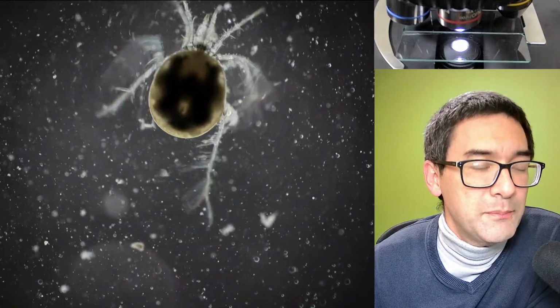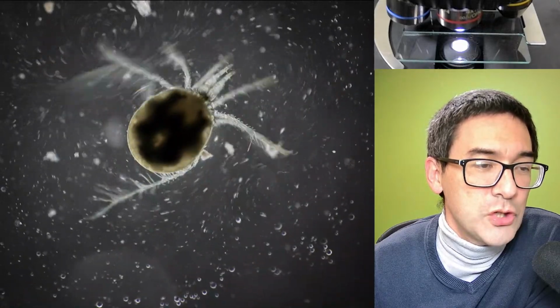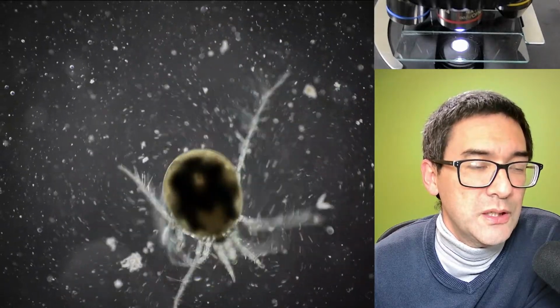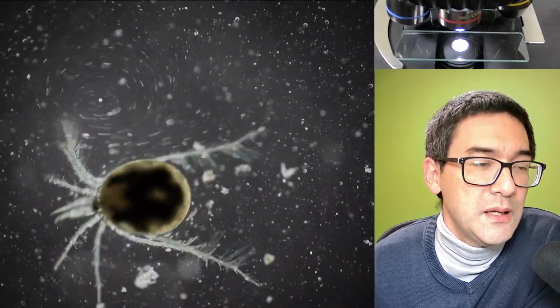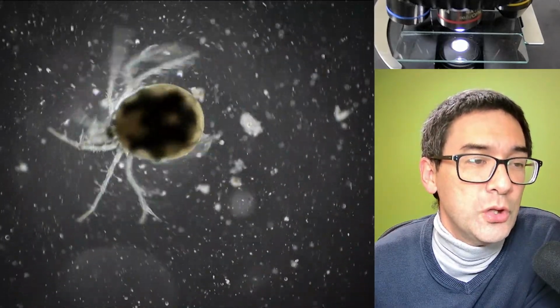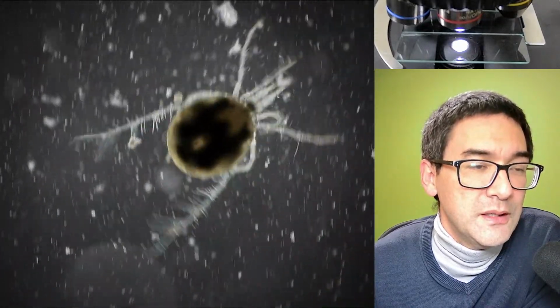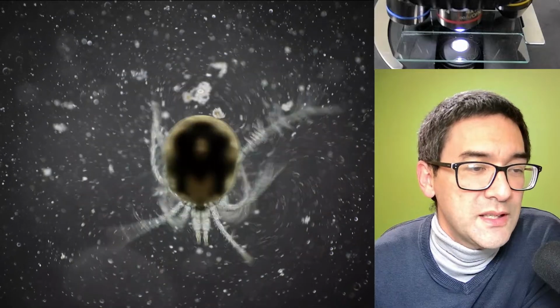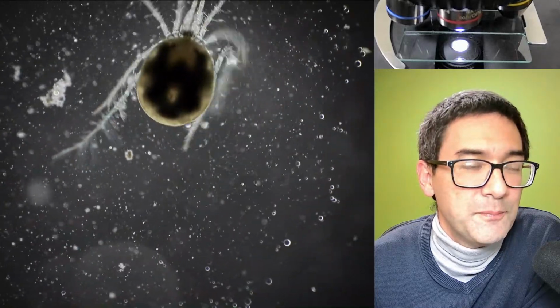Making permanent slides of mites and also insects can be a little bit challenging as well, especially because they're fairly thick. So what you usually have to do is treat those insects and mites in some potassium hydroxide, for example, which will also dissolve the softer parts, the softer organs, and will preserve the exoskeleton better. Then you have to remove all of the water using an alcohol series and so on. So preparation of insects is a little bit elaborate, especially if you want to make permanently lasting slides.